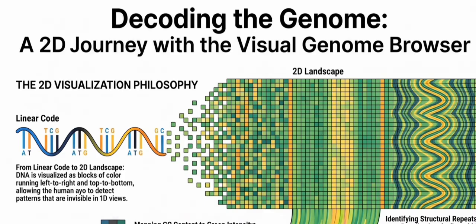Exactly. And once that massive polyprotein chain is created, the virus uses specific enzymes called proteases, which act like molecular scissors, to physically chop the long chain into smaller, functional individual subpeptides that go on to replicate the virus and cause disease. The Visual Genome browser actually understands this unique biology. It can detect the boundaries where those protease scissors cut. The notes explain that you can use the clipboard tool specifically by holding the Control key and double-clicking on the sequence to cleanly extract the precise amino acid sequence for just one of these functional subpeptides from the massive chain.